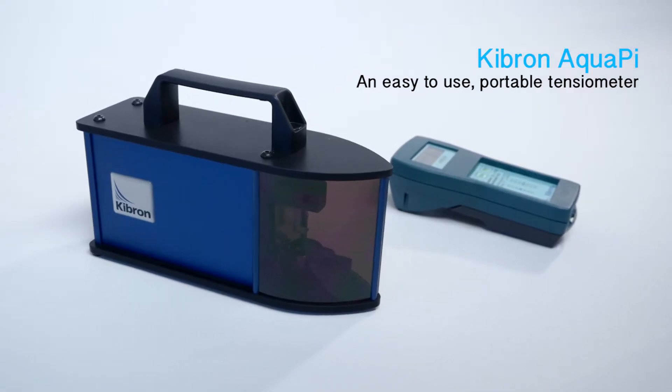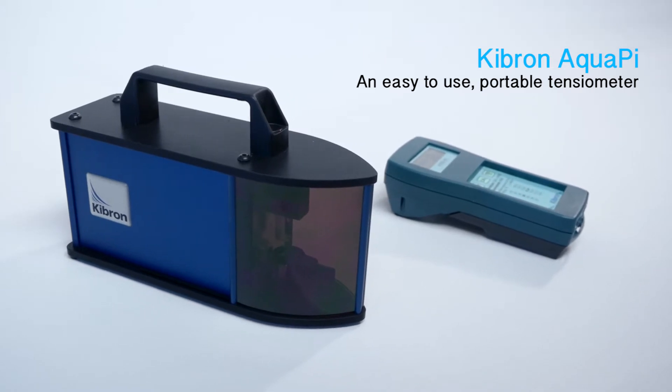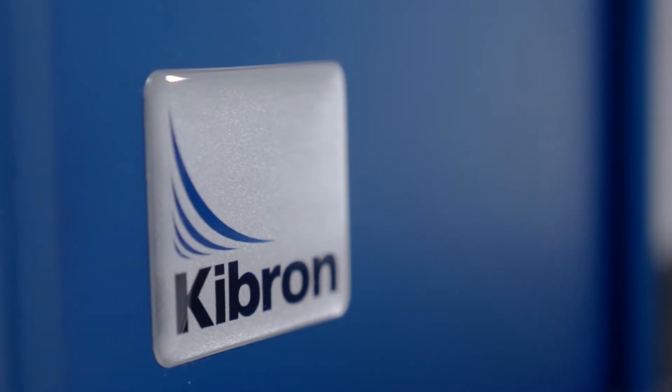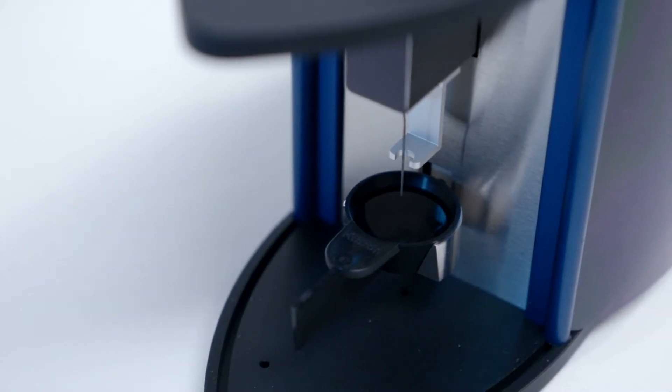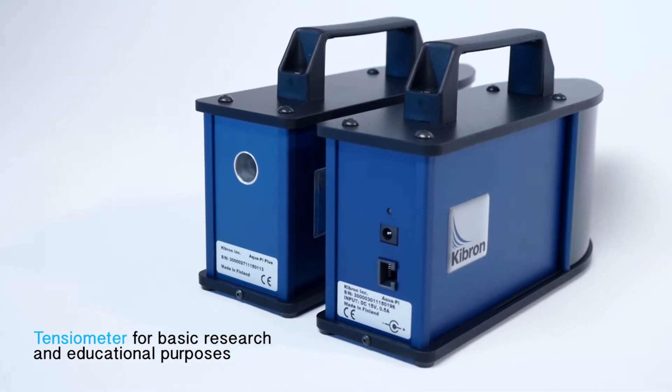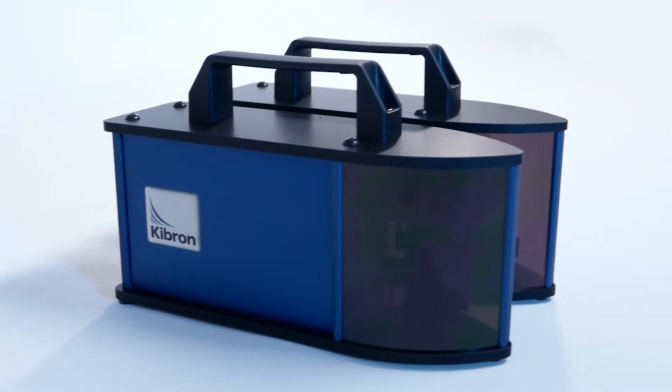The Kibron AquaPi is an easy-to-use portable tensiometer, also rugged enough for field operation and on-site measurements. With the AquaPi, you can measure surface tension easily and rapidly. With a minimum of training, an operator can take reliable measurements in well under a minute.